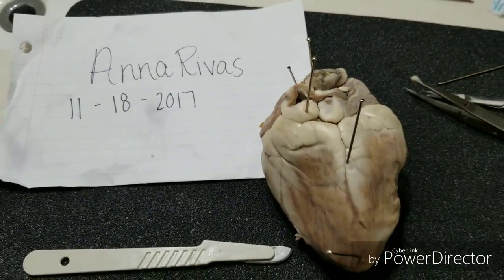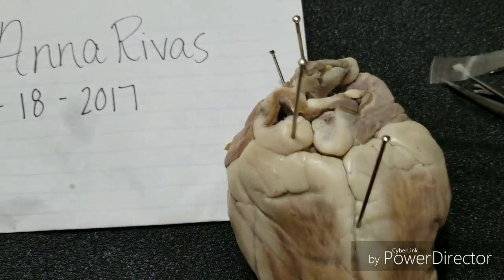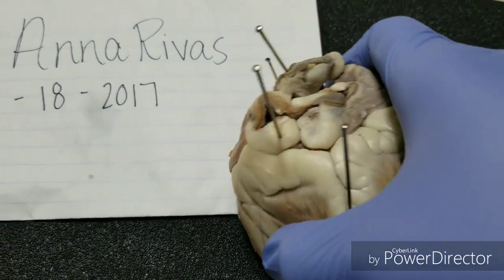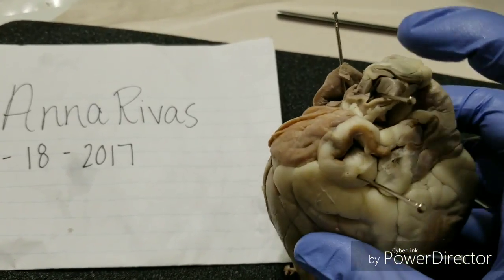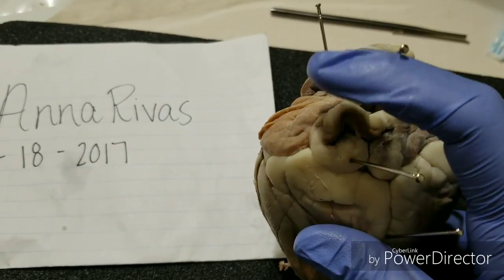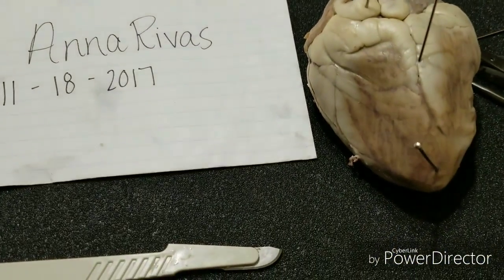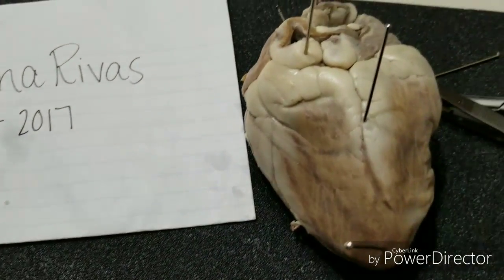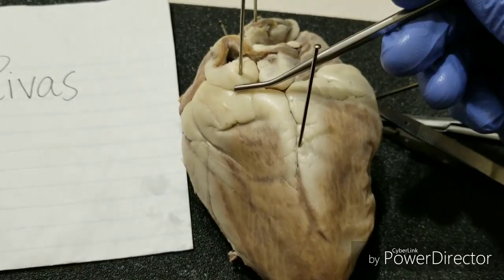This is the posterior view of our sheep heart. So we have, starting from the top, the aorta. I'm going to grab this just because it's easier. This is the aorta right over here. Right over here is the brachiocephalic artery. And then we are moving to, I'll use my probe now, right over here, which is the left auricle.